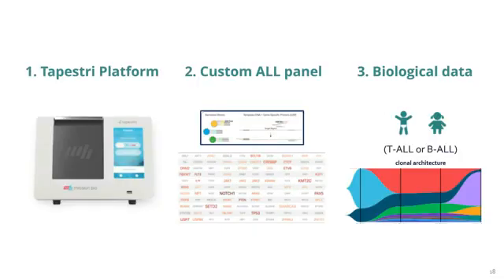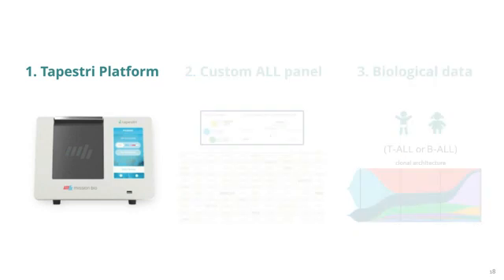So first of all, I would like to introduce you to this platform. Then I will briefly show you the custom panel that we generated for this targeted sequencing. And finally, I would like to show you some interesting data on the clonal architecture of the first patients that we have sequenced. So let me start with the Tapestri platform.